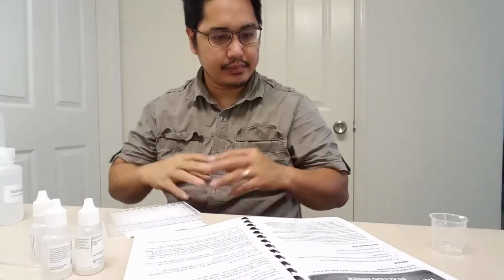All right, we're going to be doing reaction rates. The goal of this is to observe the effects of concentration on reaction rates and to develop a mathematical relationship between concentrations and reaction rates. We're also going to determine the order of reactions and to observe the effects of a catalyst.